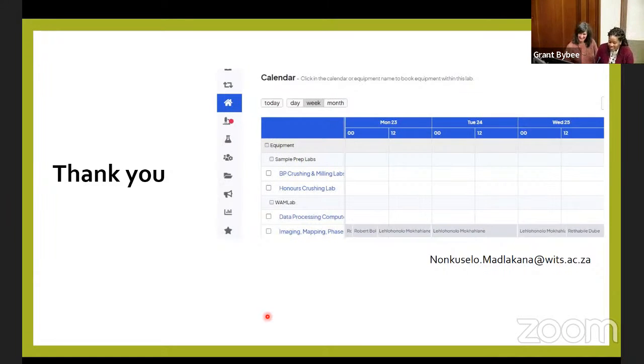Roger: How do you see this integrating now with the other microbeam techniques in the school, in the other labs? Do we have a system which will geo-reference the sample, so you can literally take your images, for instance the CL image, looking then for titanium in quartz or stuff like that, and everyone will know exactly where they are, where the laser's going? So is that capability there now, or are we building towards it?